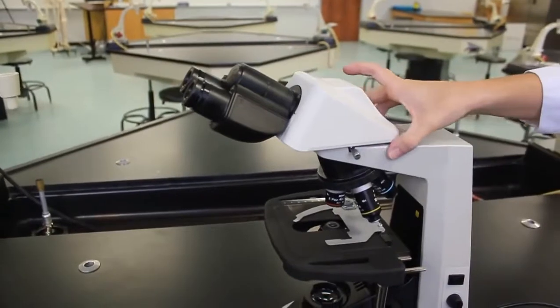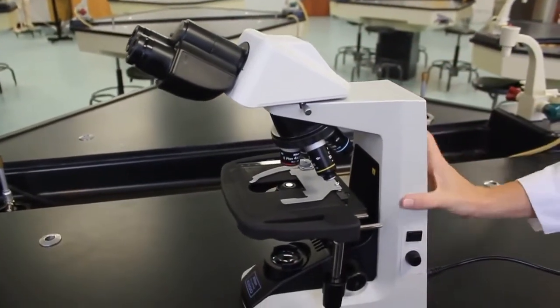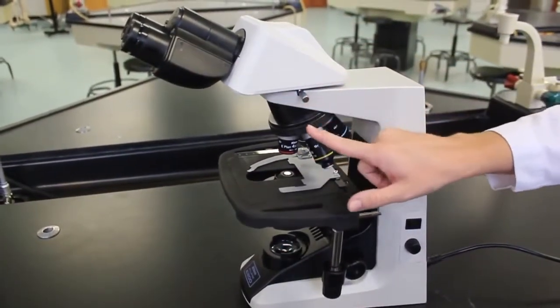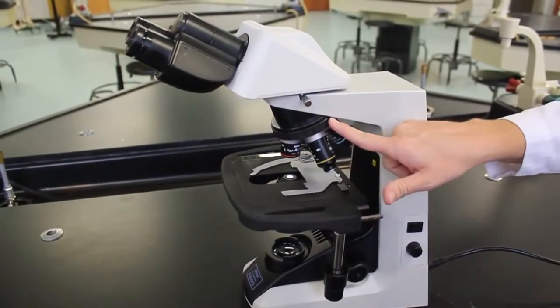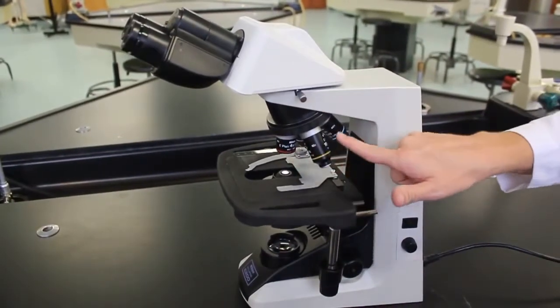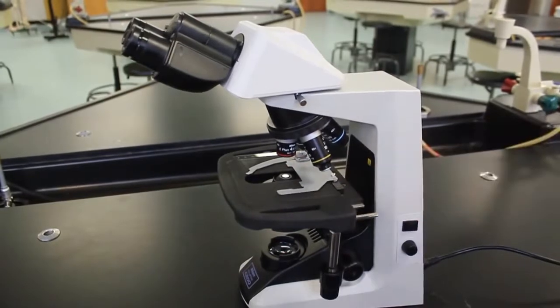Continuing down, this is the arm of the microscope. This is called the revolving nose piece. The different power objectives are attached to the nose piece.